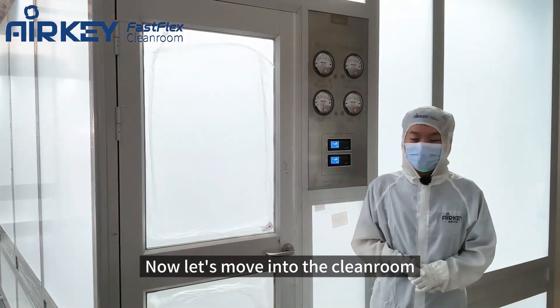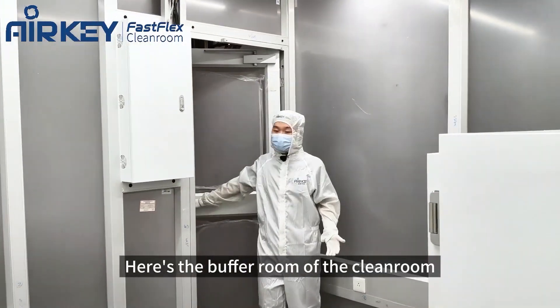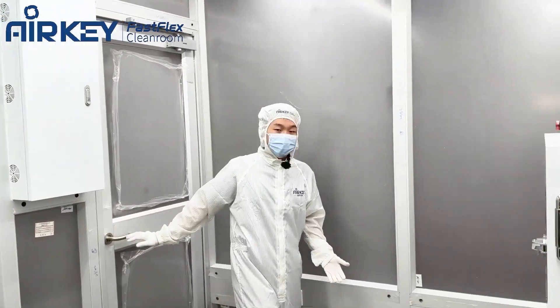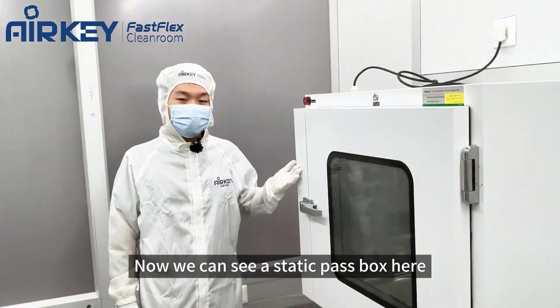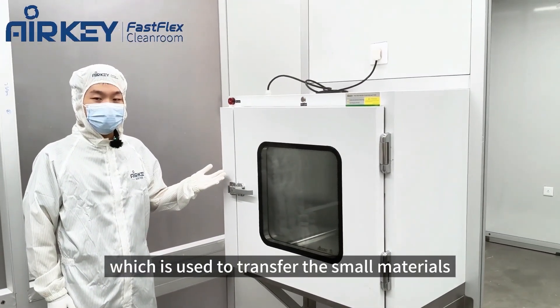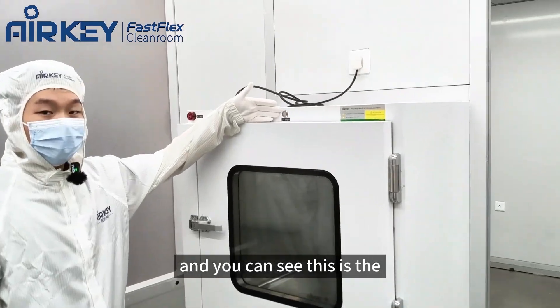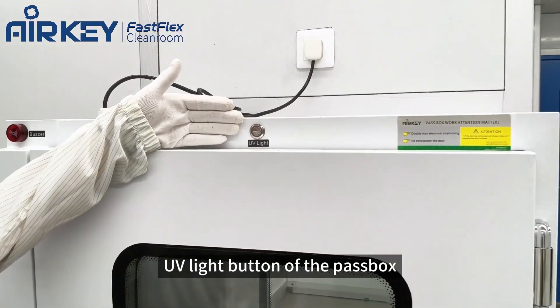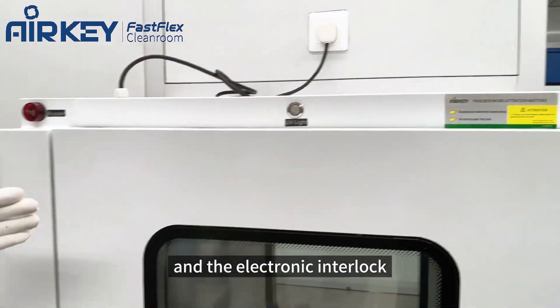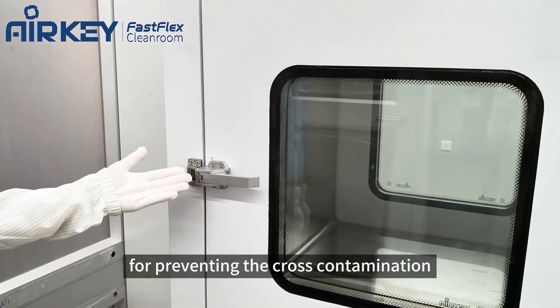Now let's move into the cleanroom. Here is the buffer room of the cleanroom. We can see a static pass box here, which is used to transfer small materials. This is the UV light button of the pass-through, and it has an electronic interlock for preventing cross-contamination.